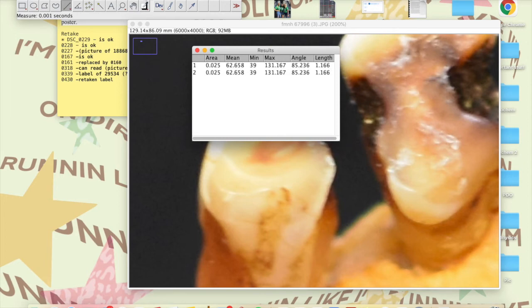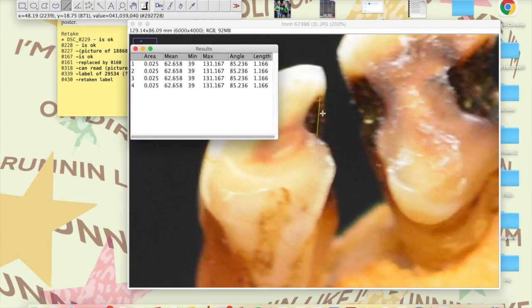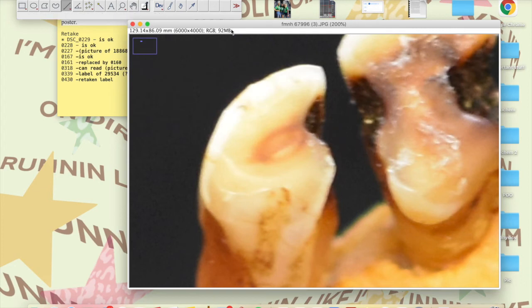All the way at the bottom, at the end of the screen, the little bar says length, and as you keep pressing Control M, it shows that the length of that cavity is, I believe, 166. And that's the value that you want, the length, which is the most important value. So the length of that cavity is 1.166 millimeters.